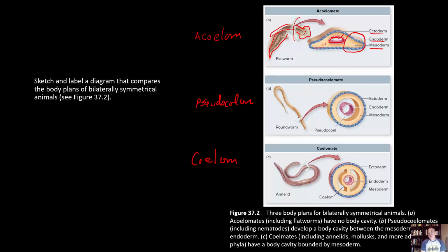Whereas if we were to take a section through a roundworm here, you can see all three major tissues that will form the organs within the animal. You have your ectoderm, which is the epidermis. On the inside, you're going to have your digestive system there, and it's just endoderm. There's no other layers on the outside or the inside. Again, the inside of your digestive tract is always going to be lined with the endoderm or gastroderm, sometimes they call it.